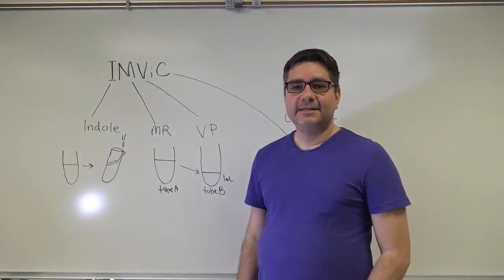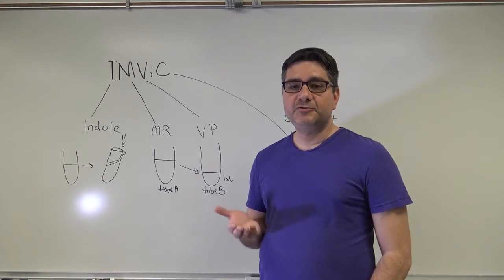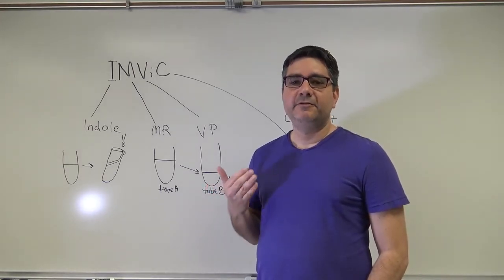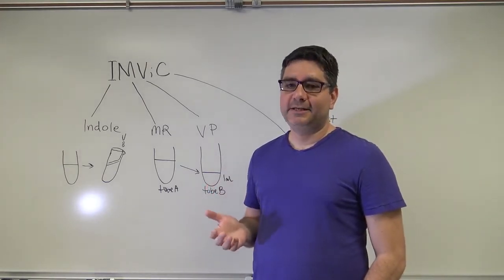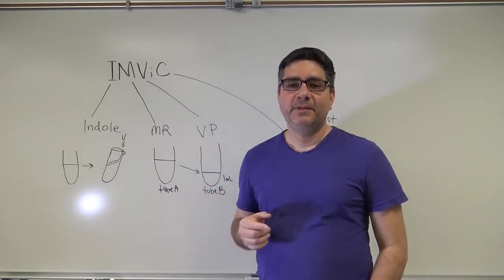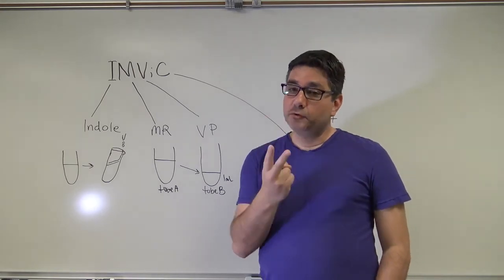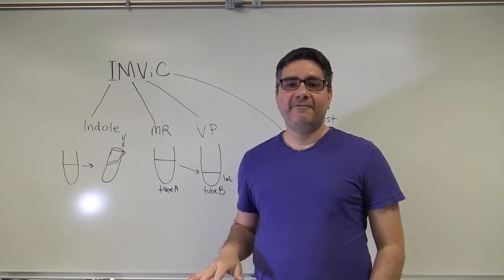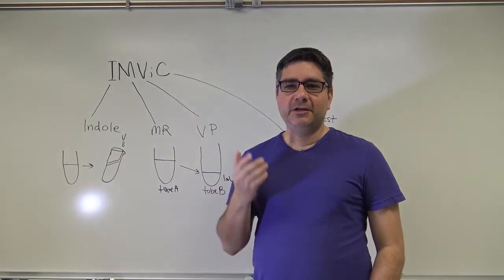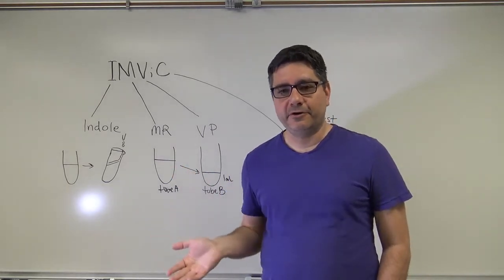The next test is a combination test. MRVP test medium is used to detect an organism's ability to form neutral byproducts, specifically acetylmethylcarbinol, or AMC, through their use of this medium. Since this test is basically 2 tests in one, I like to advertise this as a twofer, meaning you get 2 tests for the price of 1 when it comes to your working on your unknowns.